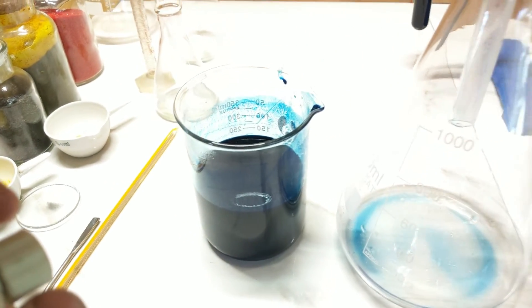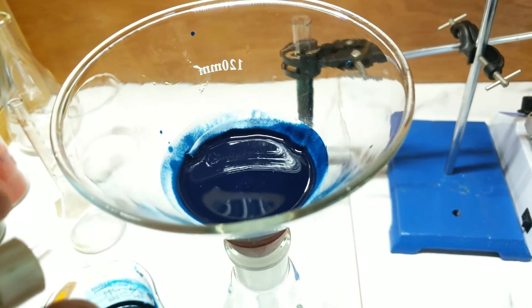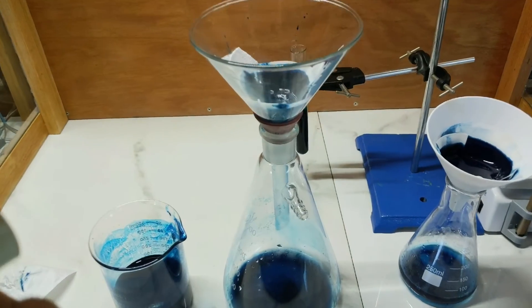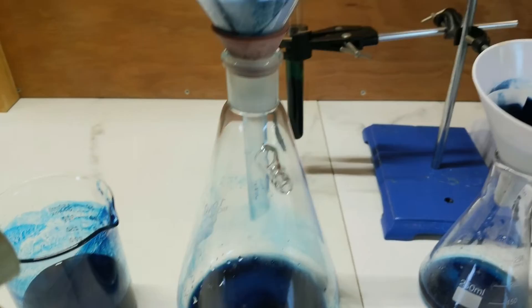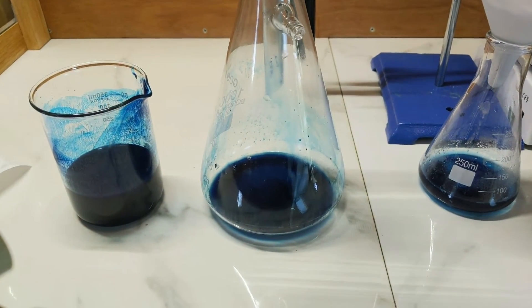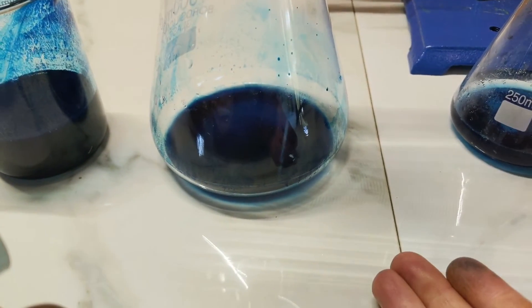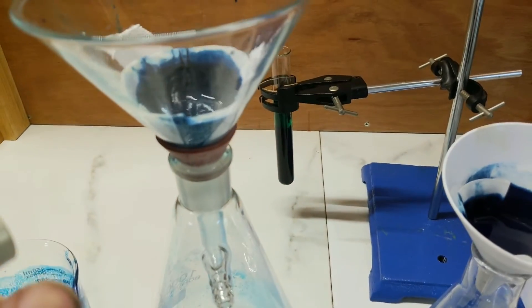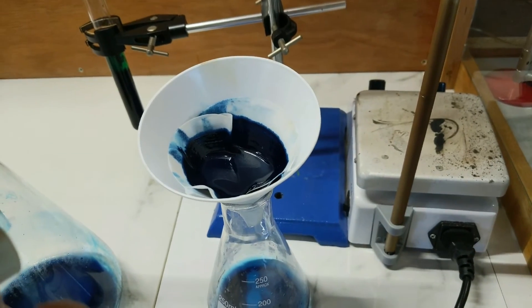Moving on to filtering — passing the pigment into a funnel with filter paper to try and filter it all out. After close to an hour of filtering, the pigment particles are so fine that they're just dropping through the filters. Vacuum filtering was tried and doesn't seem to work, so it's just good old-fashioned slow gravity filtering.